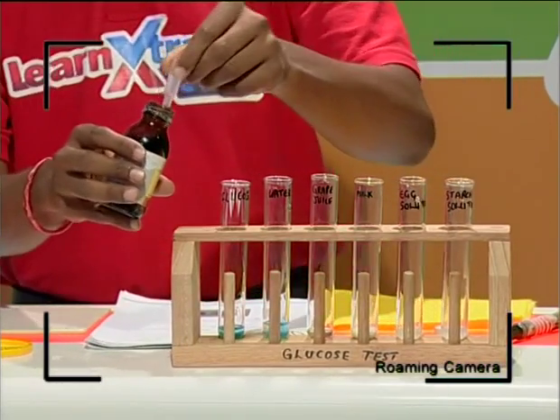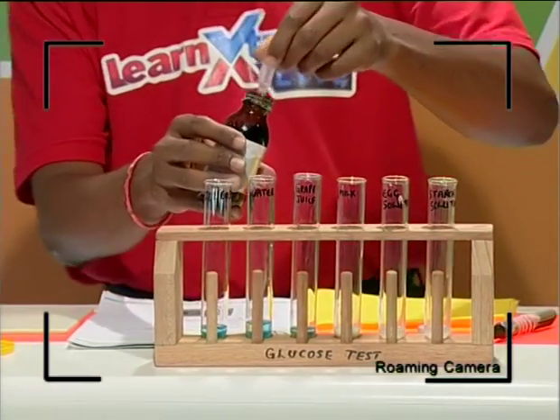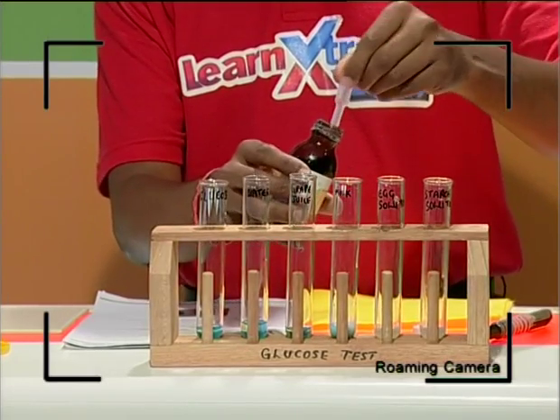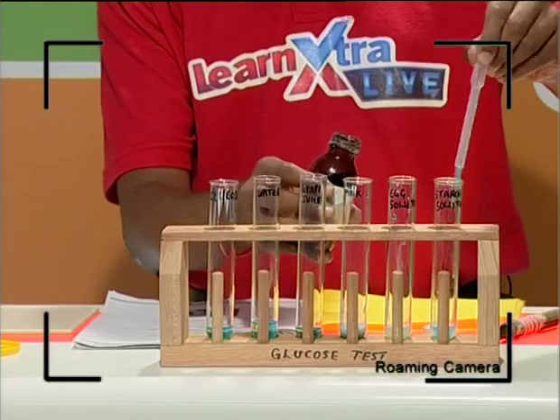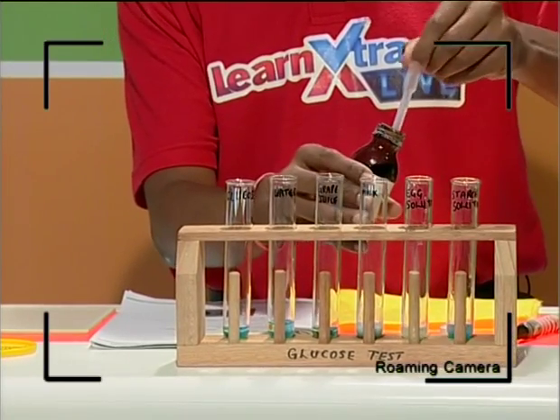And while we do this, guys, I've got a kettle that's boiling, and I'm going to put these test tubes into the kettle and allow them to stand for about 15 minutes. And while that happens, we're going to start with the next set of experiments. We'll be testing for the presence of proteins in different food samples. So now we've added Benedict's, almost 2 mLs into each one.